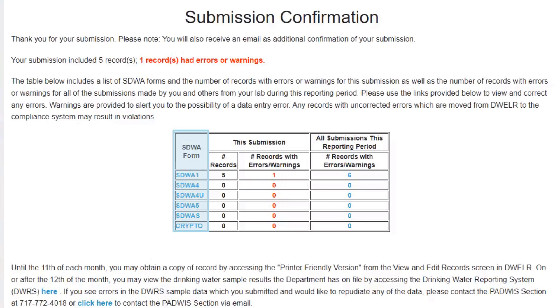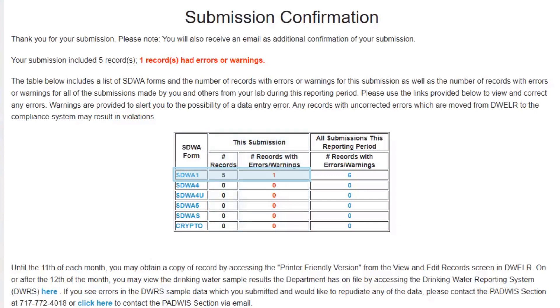The first column identifies the SDWA form. The second and third columns are related to the submission you just made. You can see that, for our example, five records were entered for the SDWA-1 form, and that there is one record with an error or warning. The fourth column identifies any error or warning with data reported using your laboratory ID for the current reporting period.